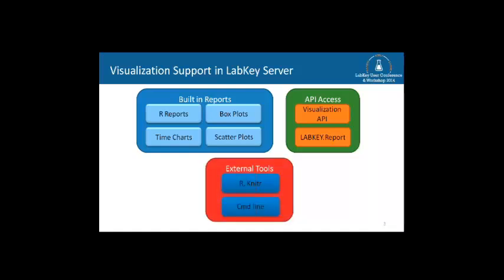And then the third category is what we call external tools. These are things that LabKey Server integrates with. They're separate tools, separate applications. A good example is R and knitr. And then something I call command line. So the framework in LabKey for adding different types of scripting engines, you can add if there is an application that can be invoked externally via the command line, and it can take data in and produce data out.